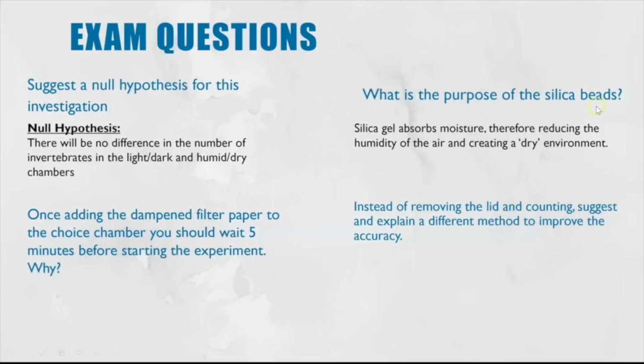The purpose of the silica beads. The silica gel or the silica beads absorbs the moisture in the atmosphere, and that is how we create this dry chamber environment. The next one, once adding the dampened filter paper to the choice chamber, you should wait 5 minutes before starting the experiment.